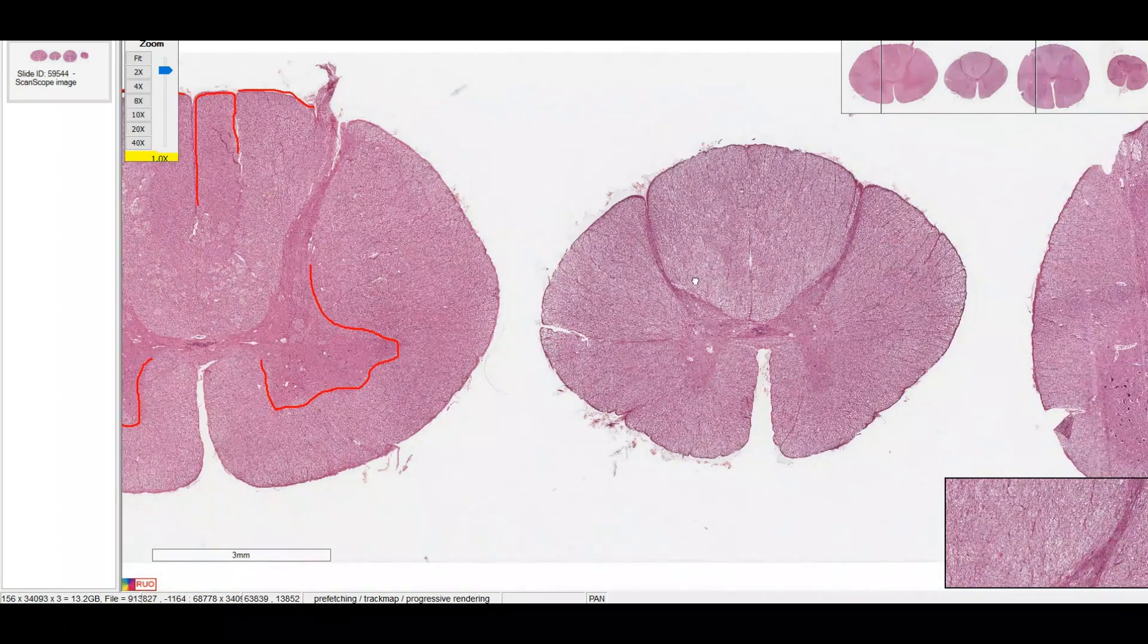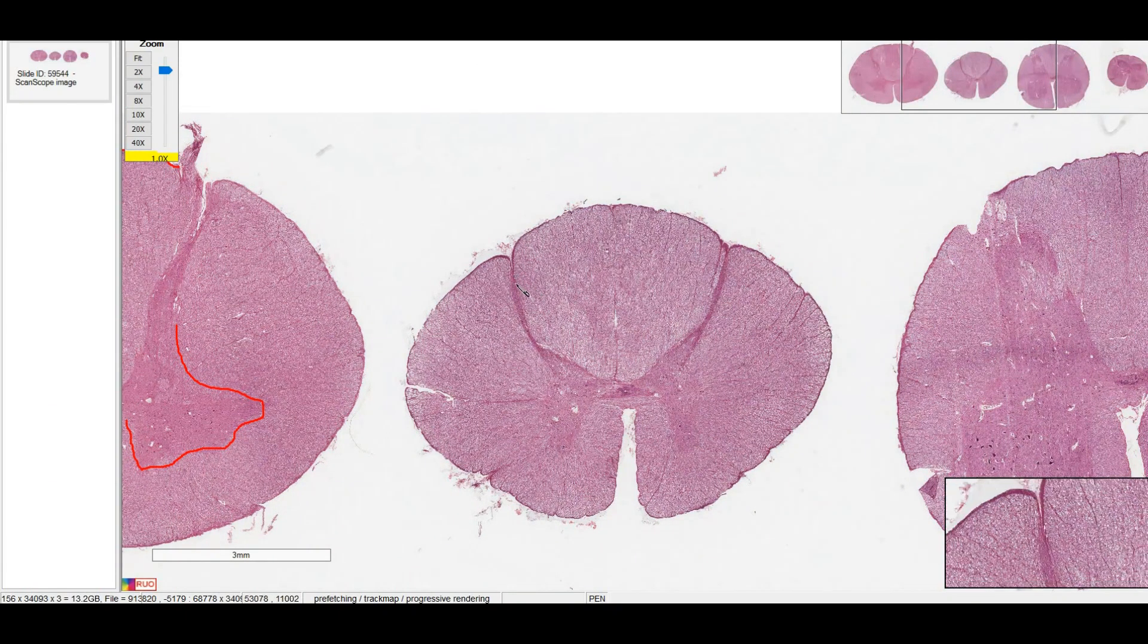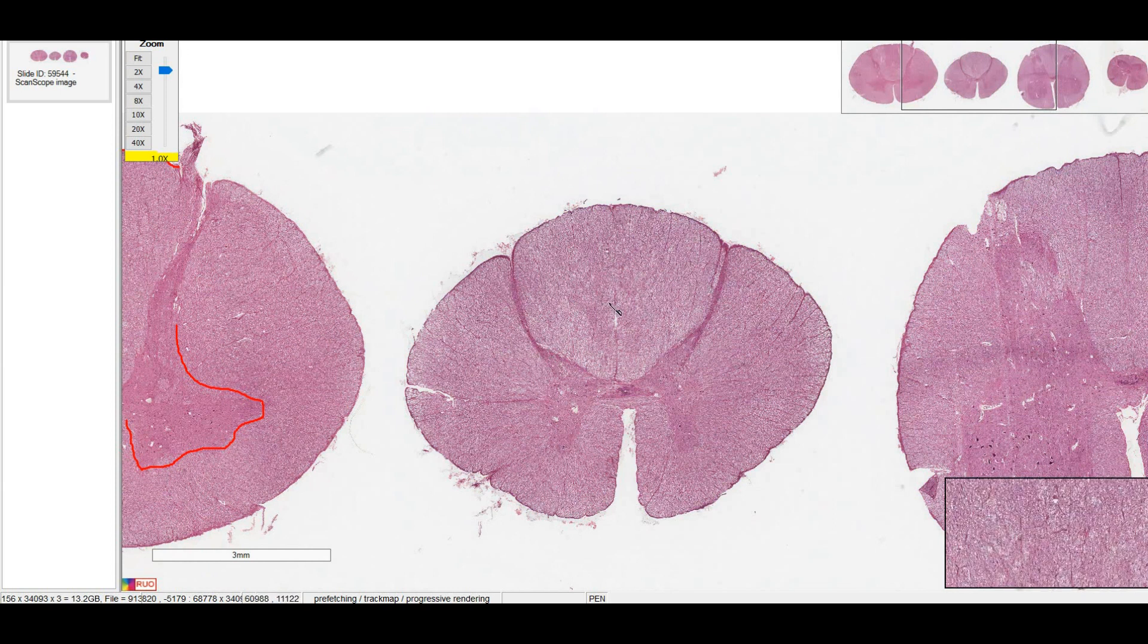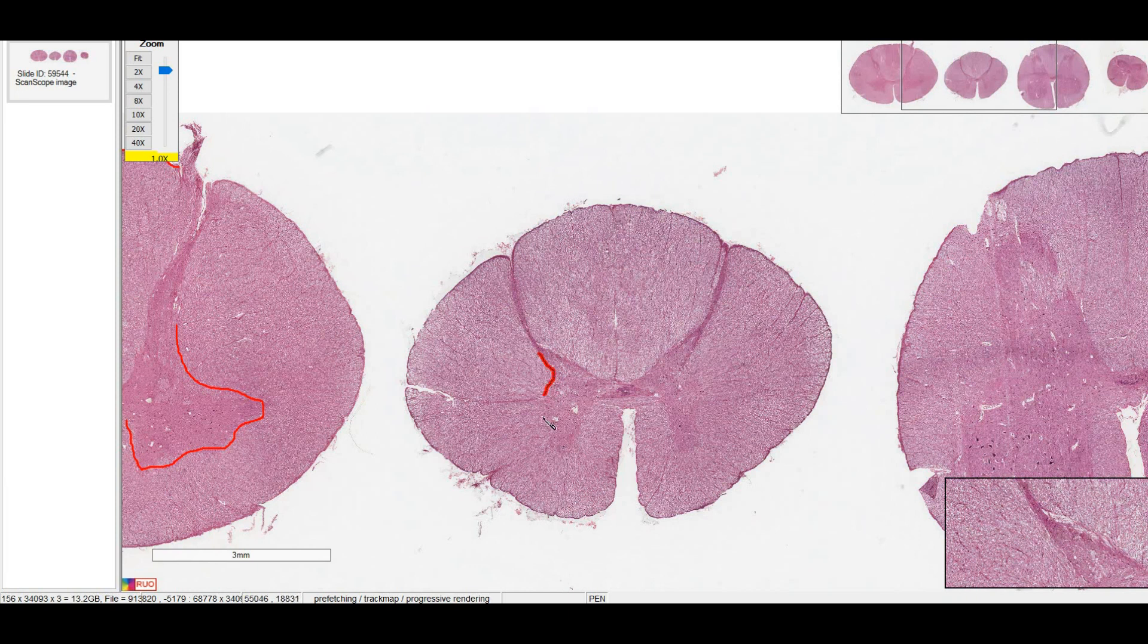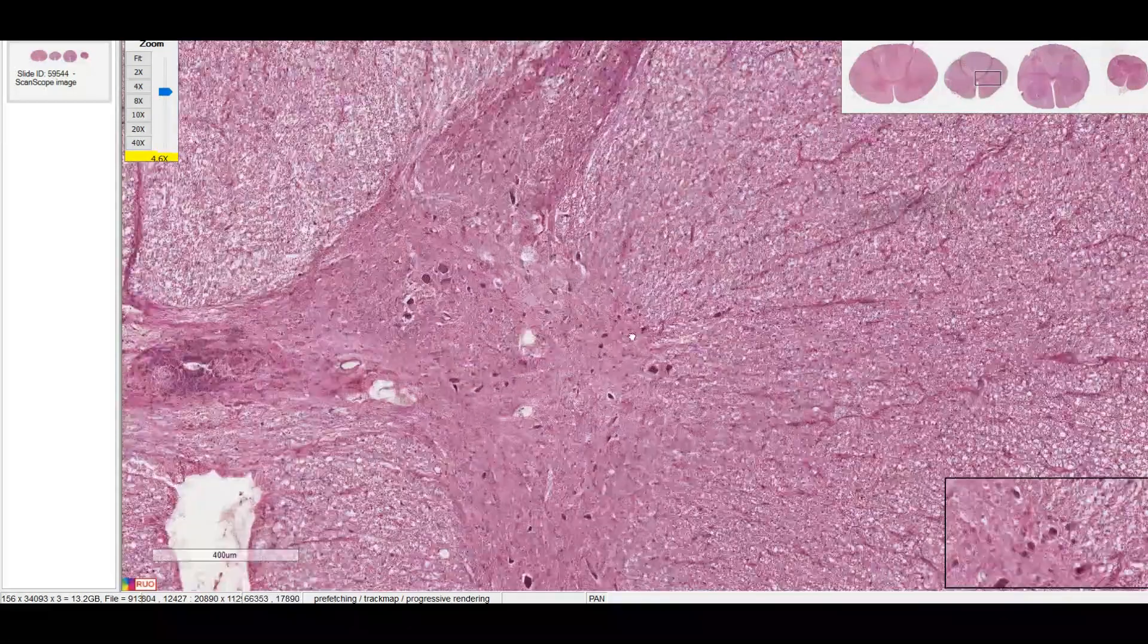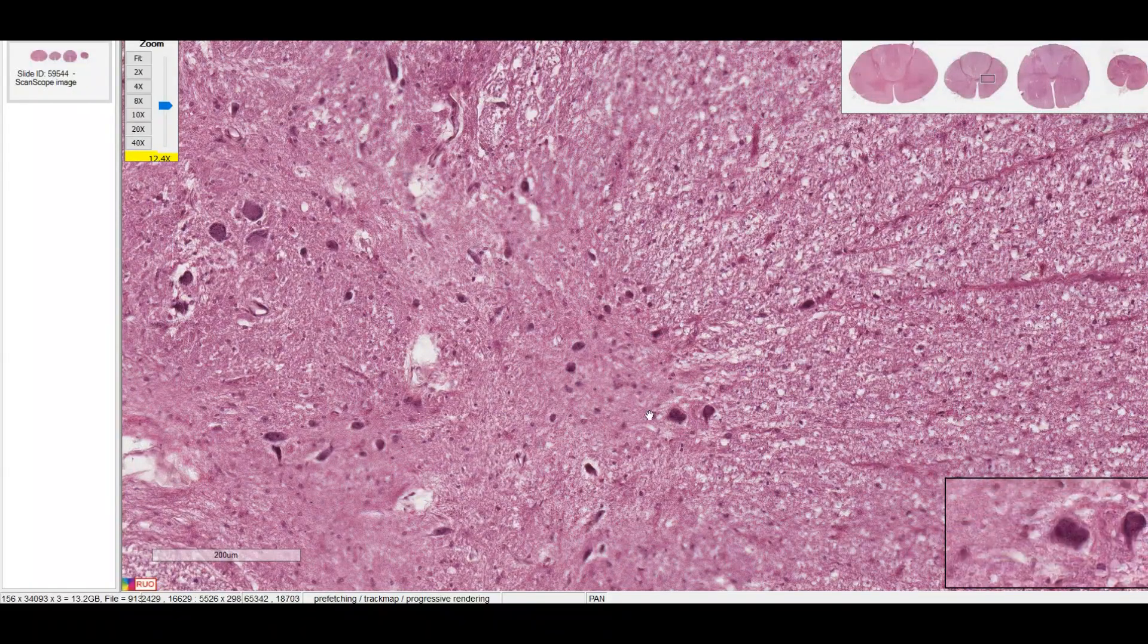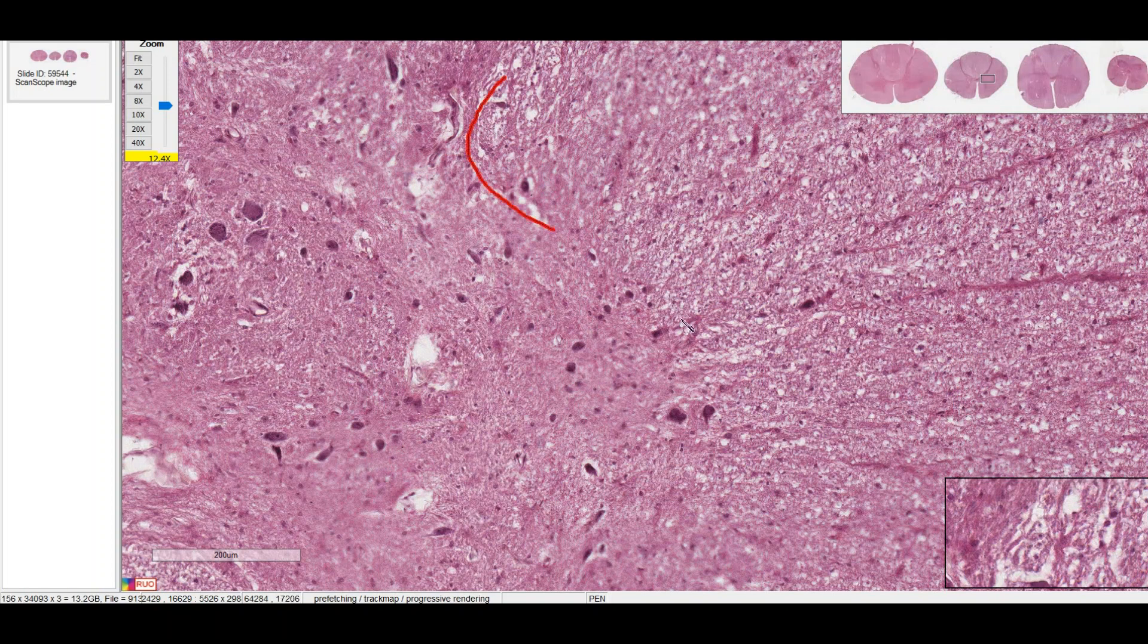Now let's take a look at the thoracic spine. Similar to the cervical spine, we have a very thin dorsal horn, and a lot of white matter relative to gray matter. If we outline the gray matter, you can actually kind of see a little bit of the intermediate horn. If we take a closer look, I can see neuronal bodies as far out as about here. So you can see that clearly there is a little bump here for the sympathetics.